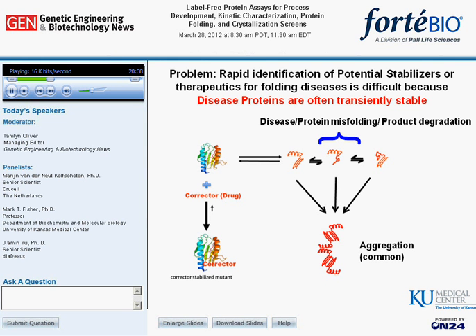As shown in this reaction diagram, current screening methodologies that identify potential correctors of the fold are often constrained by the inherent aggregation propensity that these systems exhibit. Thus, proteins that have a tendency to show aggregation or misfolding that arise from multiple states are kinetically unstable and are, in reality, moving targets. Next.